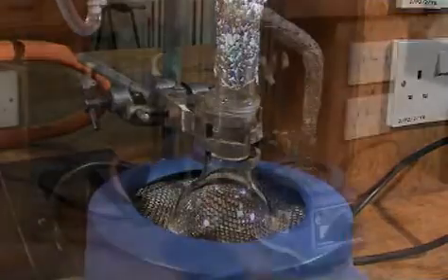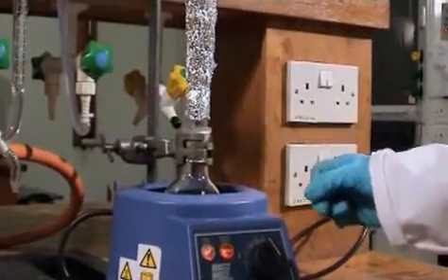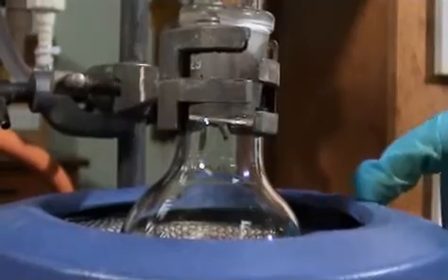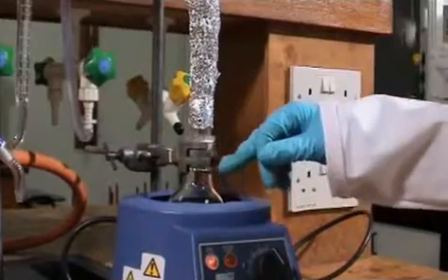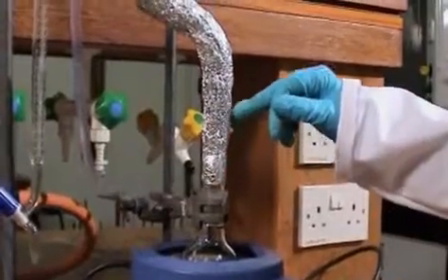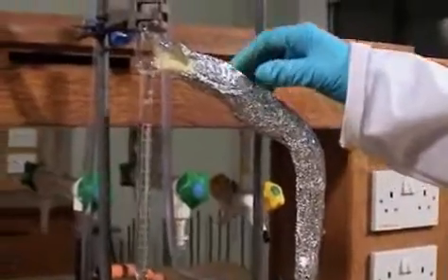We're going to do a reaction using a Dean Stark apparatus. We've got our reaction mixture here with some anti-bumping granules. Make sure you use the right size heating mantle so it fits snugly around the flask. The Dean Stark apparatus fits into the round bottom flask. This is insulated with glass wool and aluminium foil.